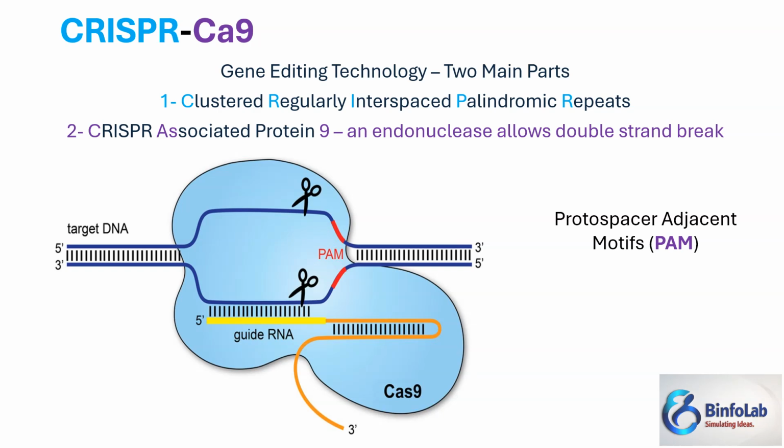So now we are going to cover some interesting tutorials. In this tutorial, we will learn how to fetch a gene from the database quickly, then how to find the PAM sequences, then how to design the gRNAs, and then calculate some efficiency analysis for gRNAs. We will complete this task using Google Colab. So let's do it.